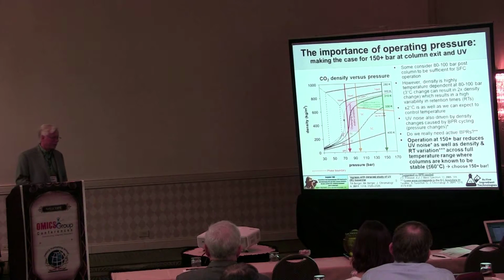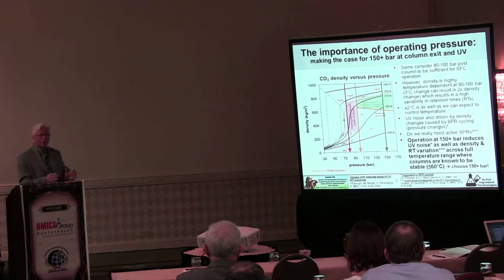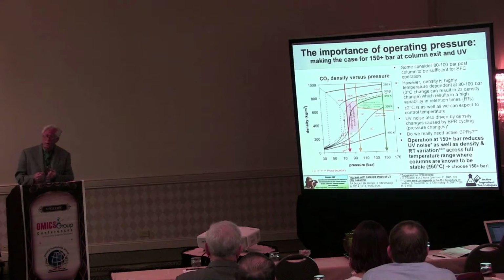So one of the things that holds us back here is, analytical chemists, we're usually pretty conservative, and when we're talking about pressure, we try to avoid pressure, right? So people try to run the HPLC with a nice low, safe pressure. But this really is not good for SFC. And the reason for that is the density changes quite a lot as a function of pressure. And you can see right in here where it's very common to operate SFCs, you can have huge density change with only a small change in pressure. Or another way to look at that is in terms of temperature. You can have just the variation in the room temperature change that density a lot. It's hard to get reproducible results when the density is changing.